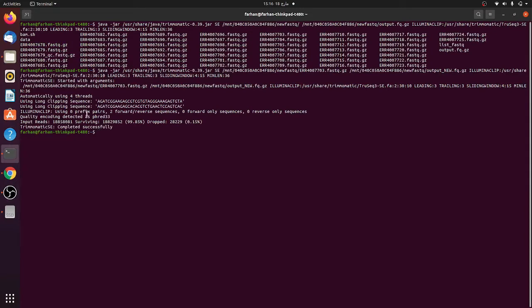Now the file has run and these are the total surviving reads. These are the drop reads, 0.15% and 99.85%. The results are now saved.